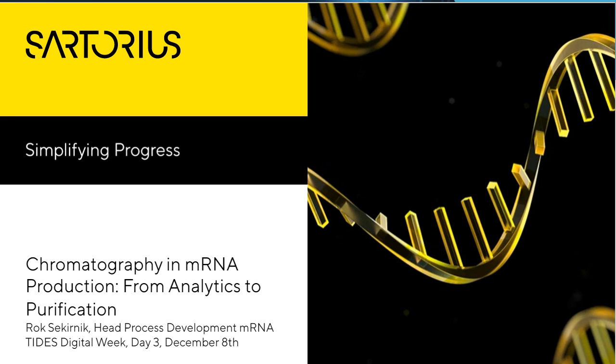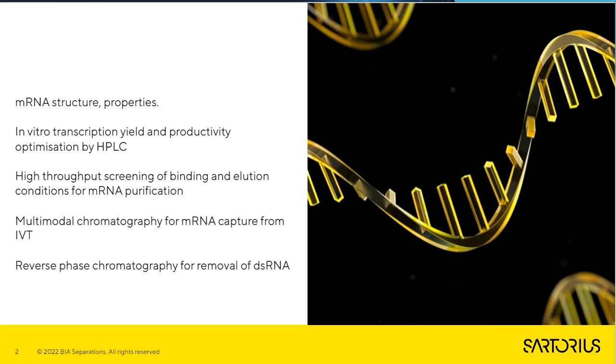We all, of course, know that mRNA has been a strongly evolving area over the past few years. A lot of the technologies and techniques implemented into the production of mRNA have not been fully optimized or evolved from the traditional production and purification methods that have been used for the last 30 years in the mRNA field.